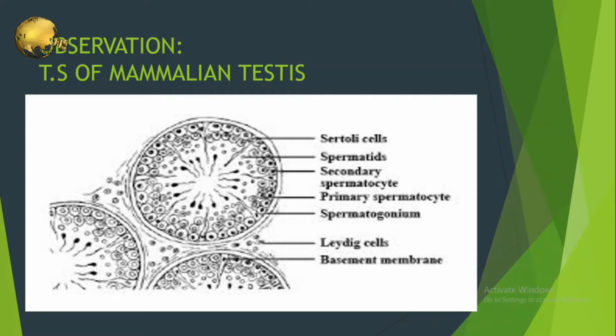is sperm. Between the germinal cells, the pyramidal shaped cells called Sertoli cells are present. A large number of sperms have their head embedded in the Sertoli cells. The Sertoli cells or sustentacular cells or nurse cells provide nutrition to the developing spermatids and sperm.